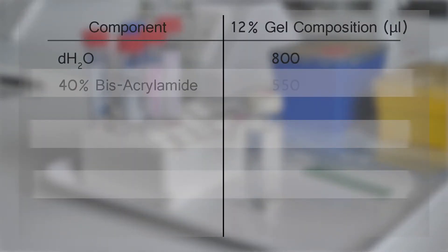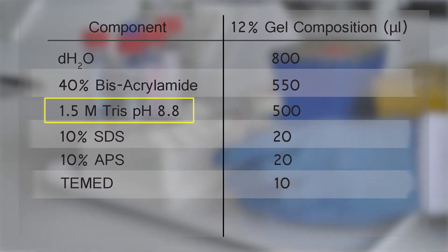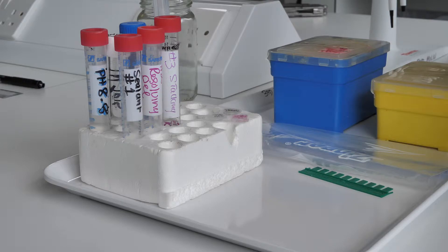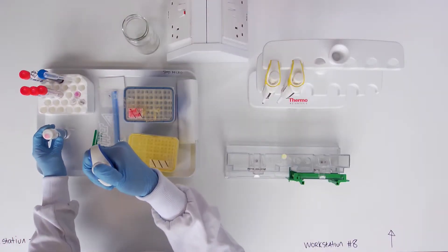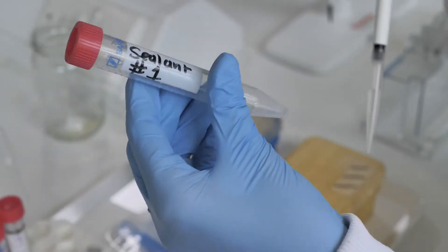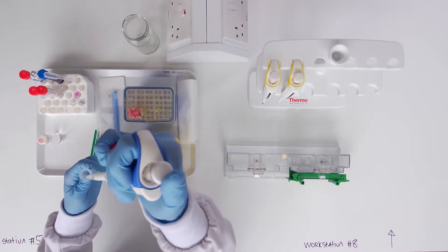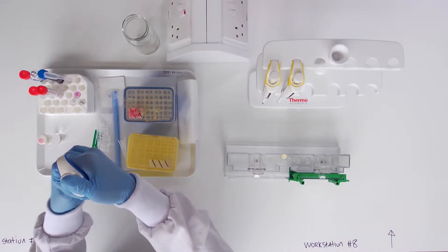First, prepare a sealant gel mixture containing the following components. It is important that you check that you use the 1.5 molar Tris pH 8.8, as a similar buffer at pH 6.8 is supplied for the stacking gel. Note that tubes are recapped immediately after use.